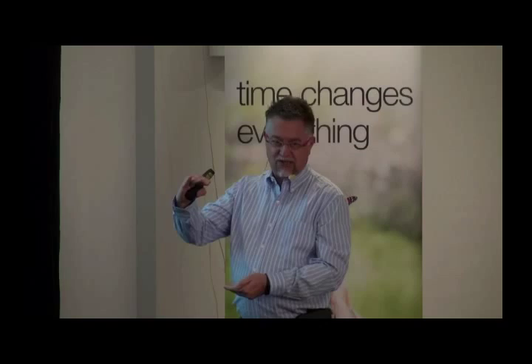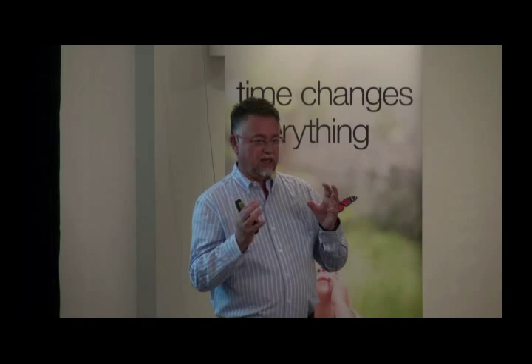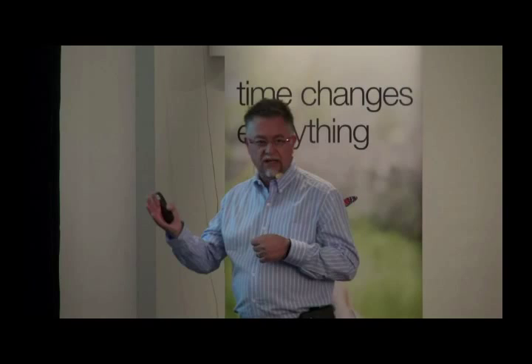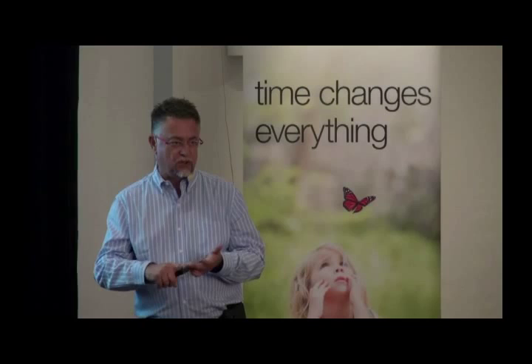So no way. But what a flow cytometer is, remember, you have one or more lasers aiming the beam at those little cells that are going in from top to bottom or bottom to top, depending upon the instrument. As the laser beam is on and the cells go through it, they interfere with the beam of light. The cells are spherical and they have organelles and nuclei, so some of that light will make it right through. Other light will bounce off, to the right, to the left, to the front, to the back. The sensors capture all that information and generate a fingerprint for each individual cell type: the red cell, the reticulocyte, the platelet, and the five types of leukocytes. That's the way these instruments work.